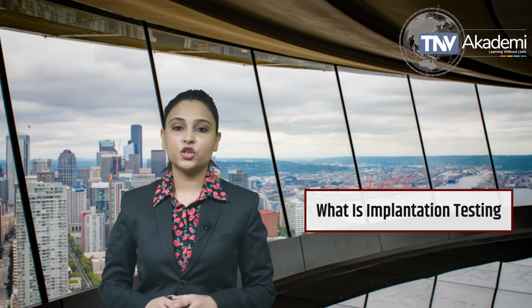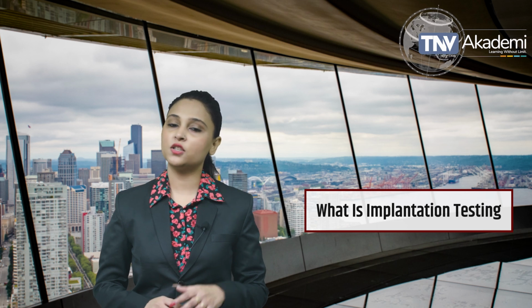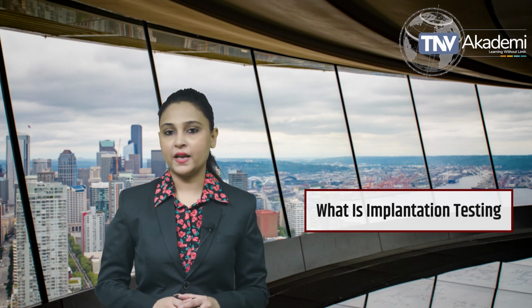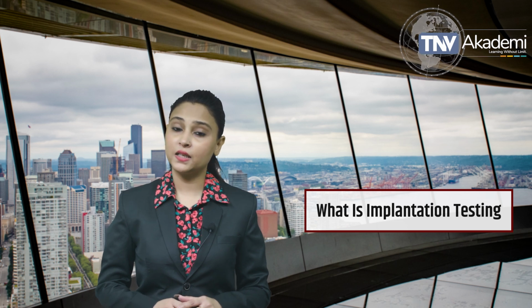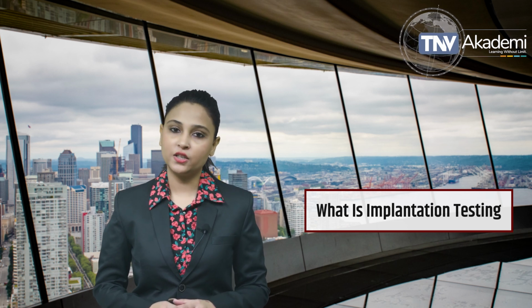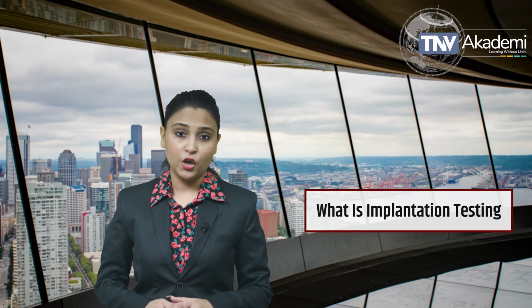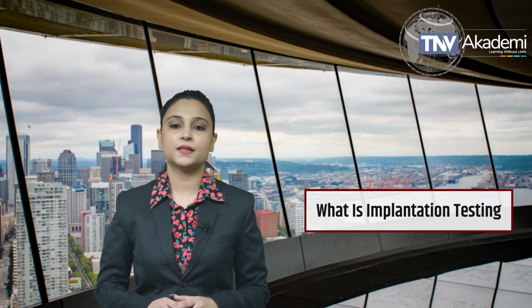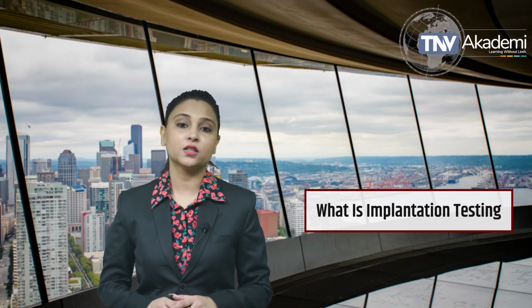What is implantation testing? Implantation testing is used to evaluate the local biological effects of medical device materials that are implanted in living tissue. By implanting a device or material into an animal model, we can observe how the tissue responds, which helps us understand if it is safe and compatible for human use.